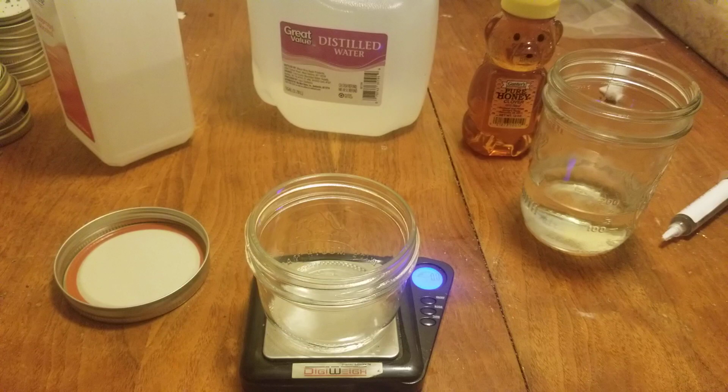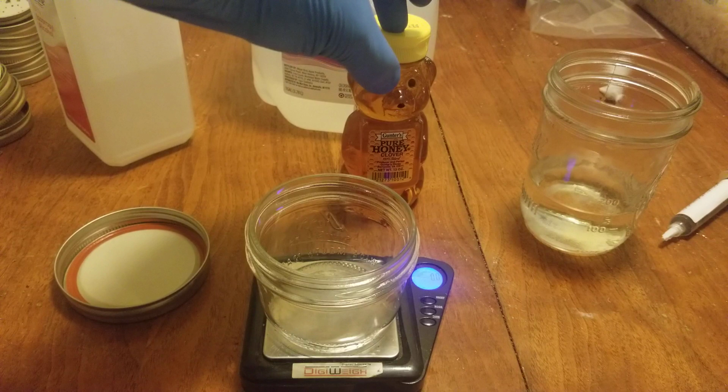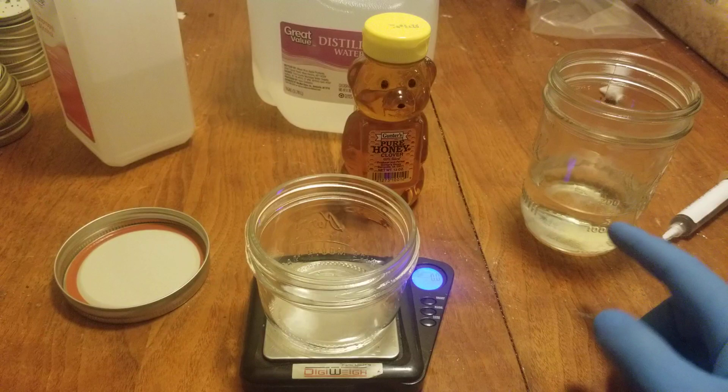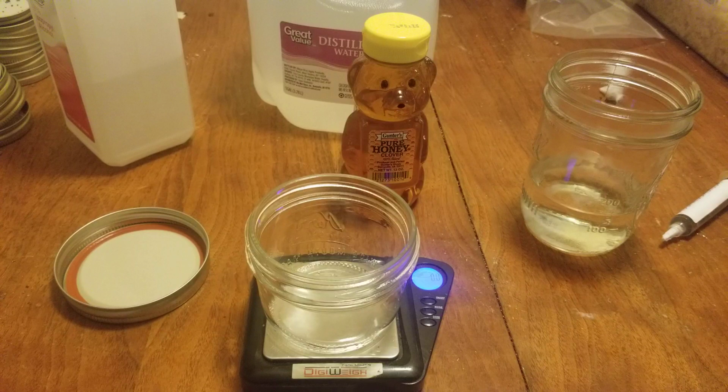So now let's talk about ratios. When you're doing liquid cultures, you want to have a 4% ratio between what you're using to feed the spores with and your water solution. We're using 150 milliliters of water, and 4% of 150 milliliters is 6 grams. Am I right on that? I think my math is right. The way you would find this out, and I don't even have a calculator in my house, is you would take 150 and multiply that by 0.04.